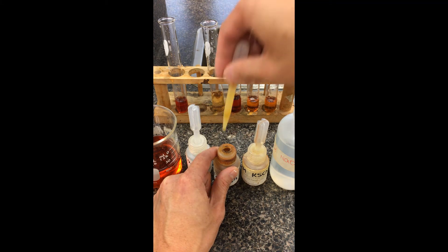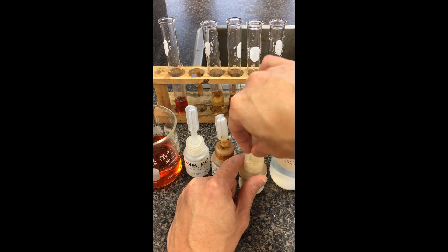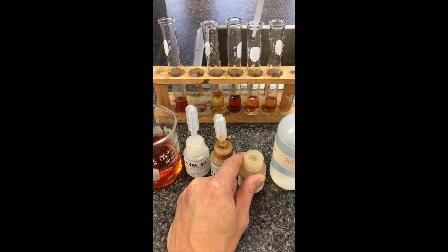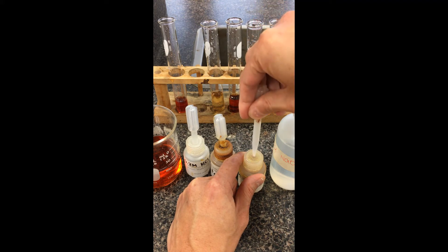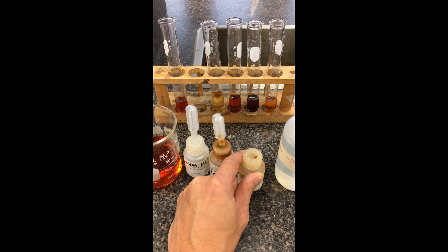You can see a distinct color change from before. KSCN for test tube D — it says 10 drops, so just going to give it a squirt. The more pronounced it's going to be if you add more of the shift ion.